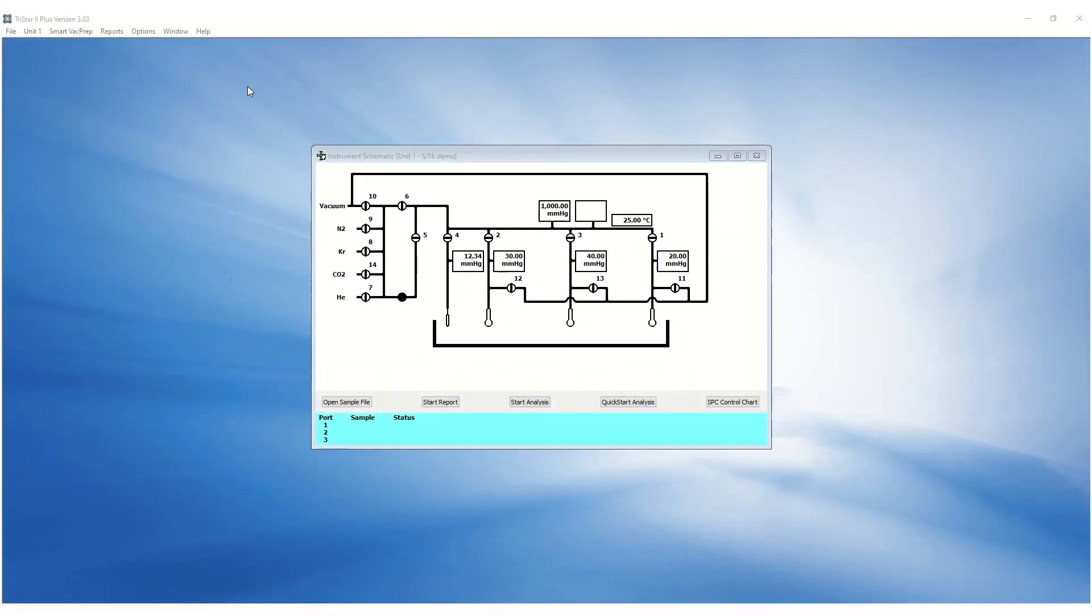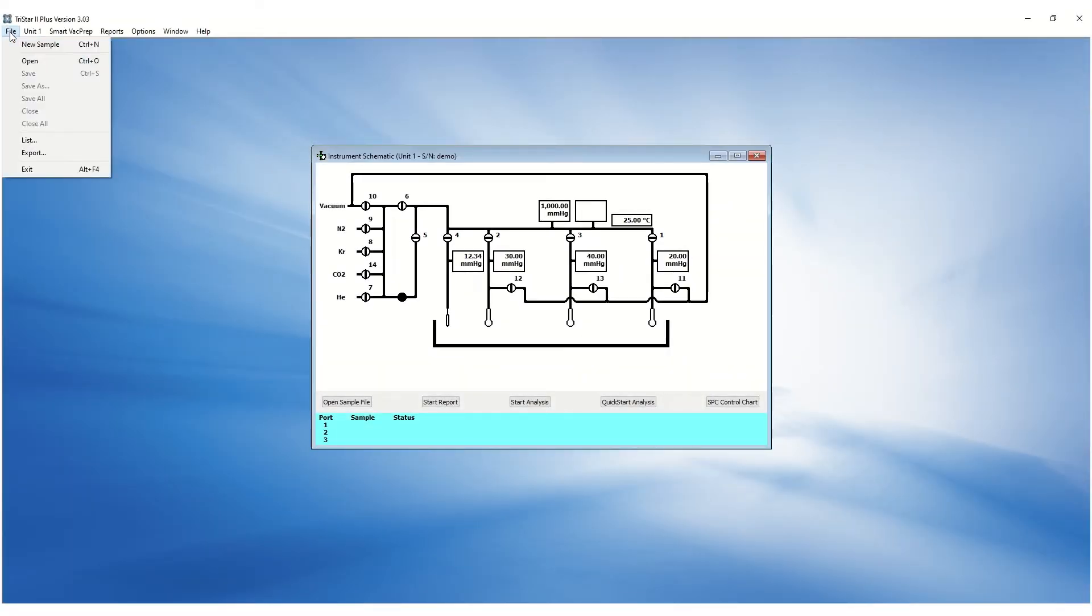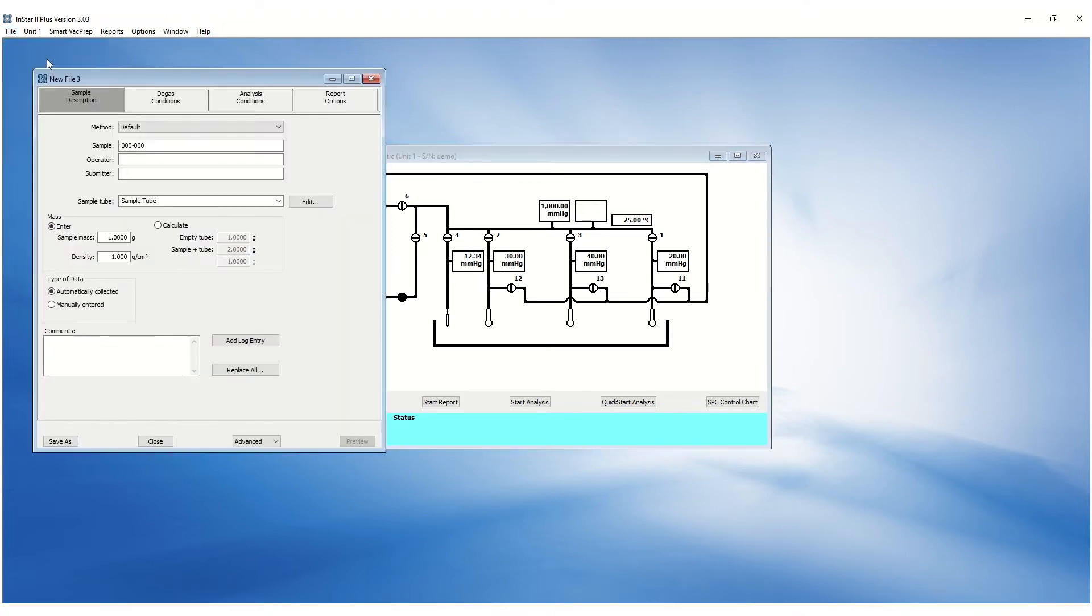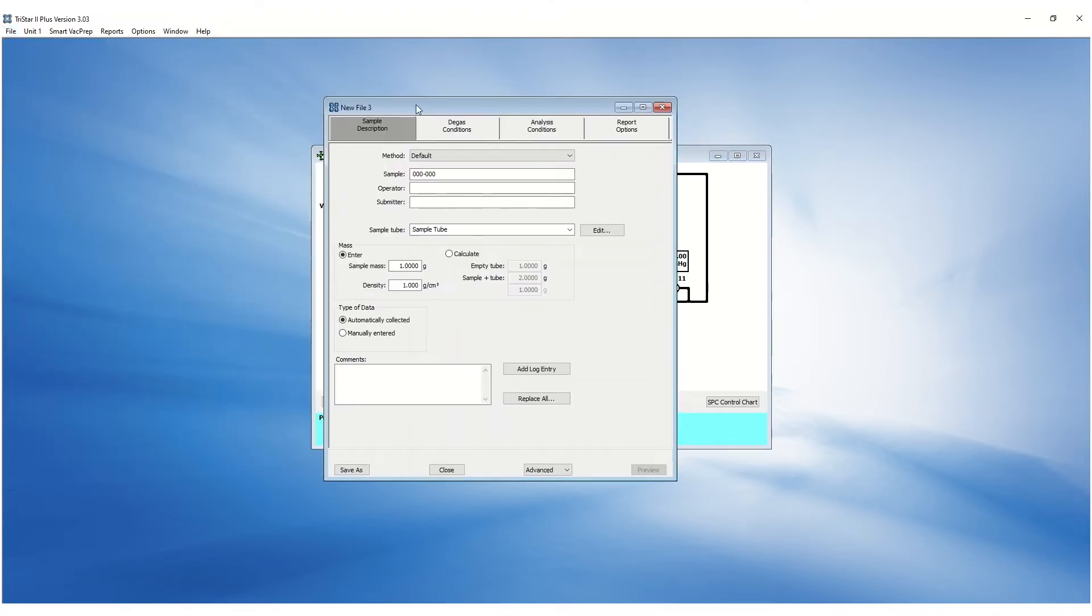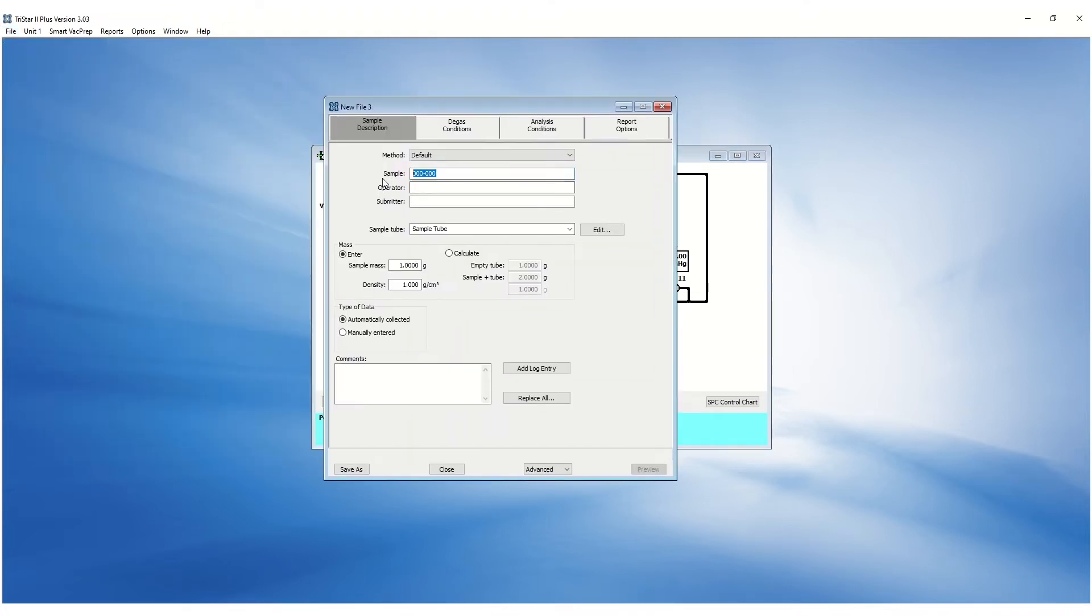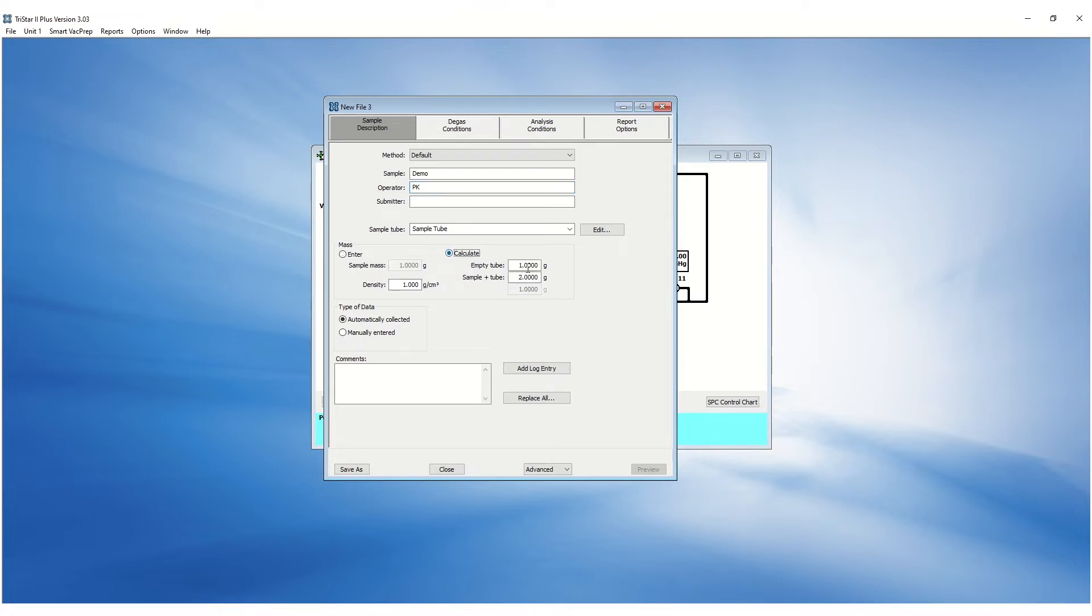To create a new sample file, go to the file menu and click on new sample. Under the sample descriptions tab, fill out the sample and operator fields. The clean mass can be entered or calculated based on the empty tube and sample plus tube mass obtained after degas.